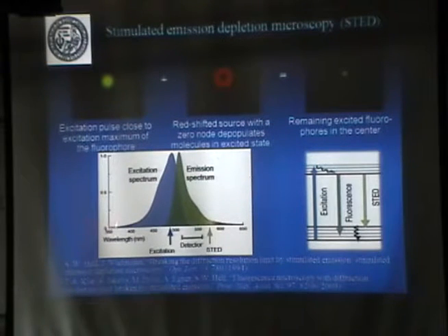Okay, so when you excite fluorescence, here you have the blue excitation corresponds to this one, and you emit in a longer wavelength. So you illuminate around here at 500, you get light more like green, yellow. Now all this light comes from the same fluorophores, from the same particles that are emitting the light. So if a particle is in some of these states, now if you can deplete, essentially take all the atoms that are emitting from here down here, then there's no more emission.